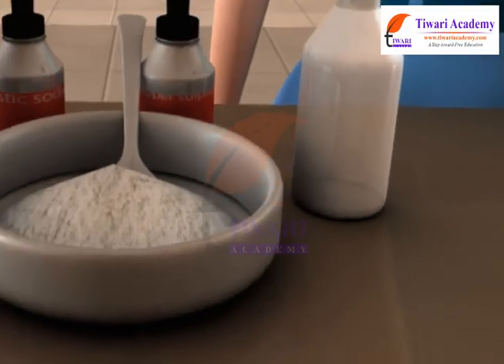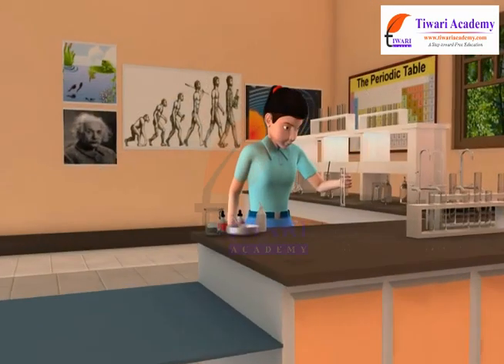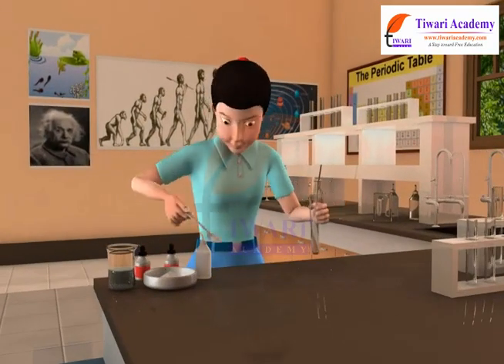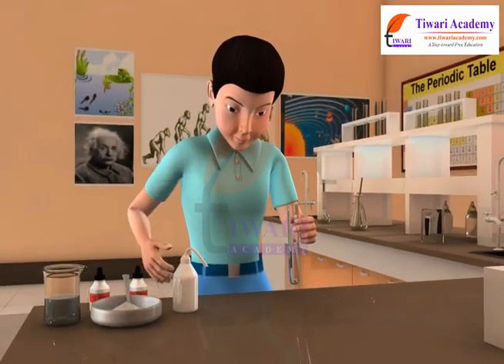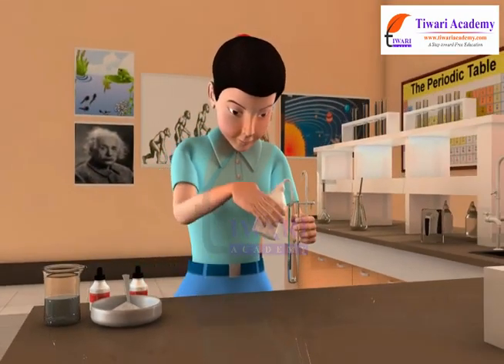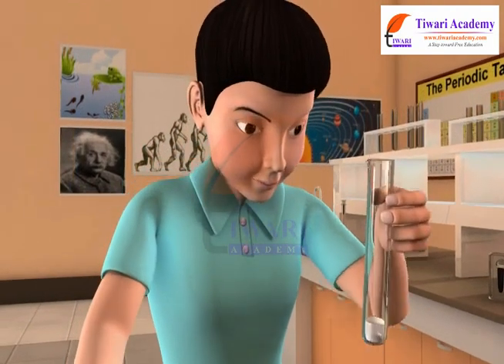Take a small quantity of the food items to be tested. Make a paste or powder of the food item. Put some of this food item into a test tube. Add 10 drops of water to the test tube and shake the mixture.